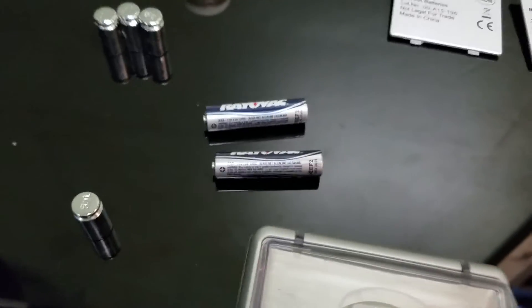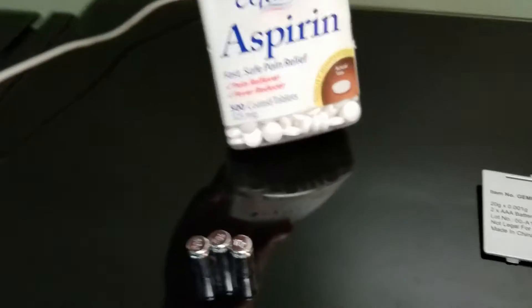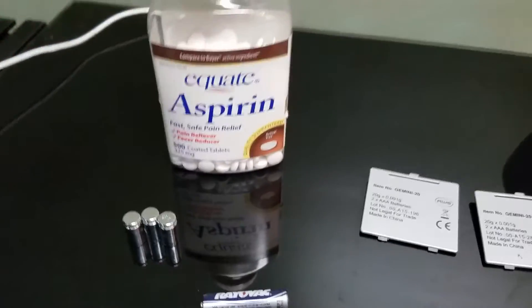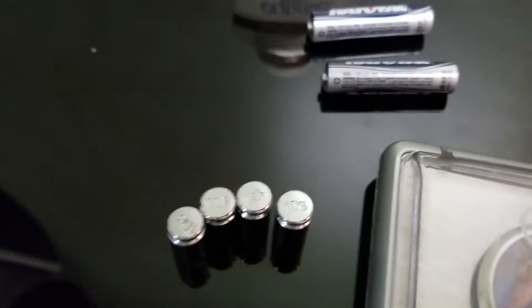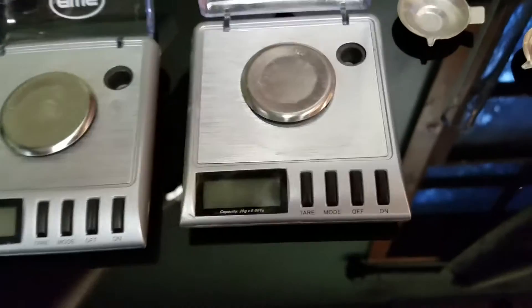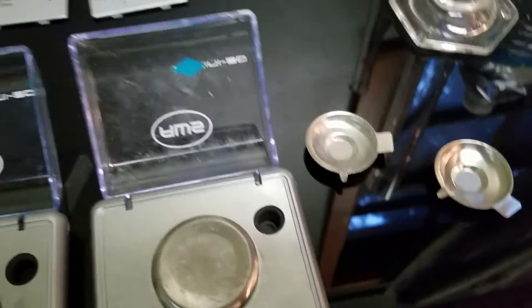I've got two scales, same model, same type. I'm going to use the same batteries for each one just to keep control. I've got 325 milligram aspirin tablets that are coated, so they're probably going to weigh a tad more than 325. And I've got a graduated cylinder that's 50 milliliters and some water as a control. Each of these scales came with two 10 gram weights, which are used for calibration and to make sure your scale is on point before you weigh a supplement or anything you plan on ingesting.